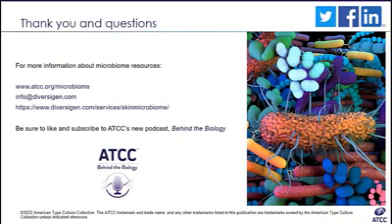Yeah, so that's a great question. Although we talked mostly about analyzing certain regions of the 16S gene in today's webinar, I would say that other approaches like full-length 16S sequencing and shotgun sequencing do have a number of different advantages in skin microbiome research. When we talk about full-length 16S sequencing, we are actually trying to get a better resolution, mostly at the species level. We mentioned very briefly in the webinar that getting that species-level resolution is very important in skin microbiome research for a number of different reasons. For example, when you're trying to differentiate between bacteria that can cause disease and those that are actually commensals.